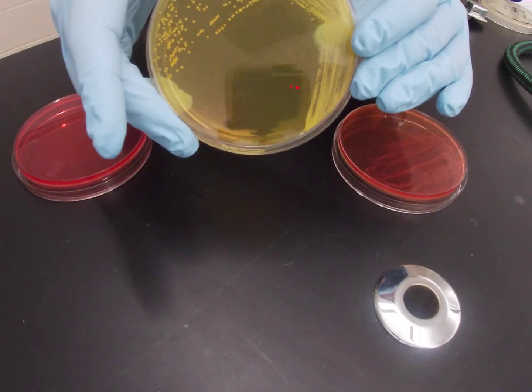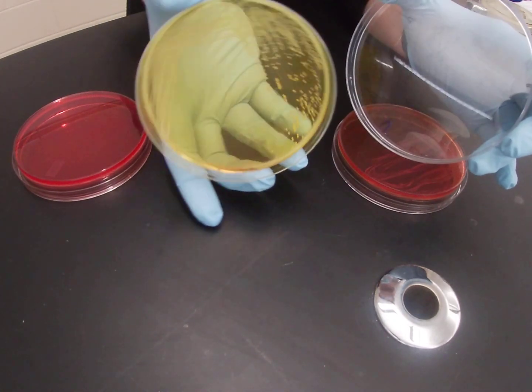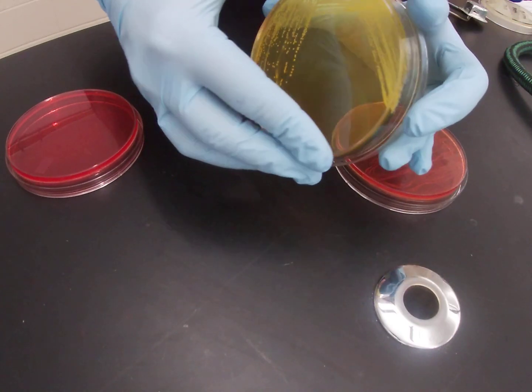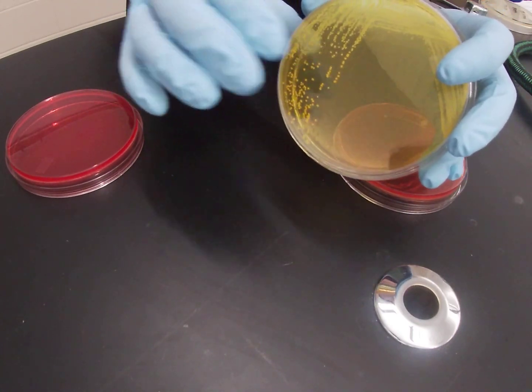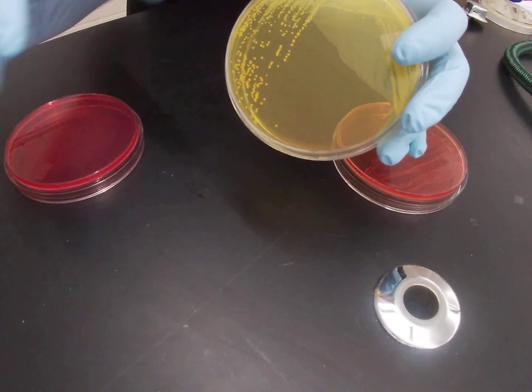Here you can see Staph aureus growing on a mannitol salt plate, and you can see that the plate is now very, very bright yellow, which is indicative of mannitol fermentation. So when organisms can ferment mannitol, they change the plate from this red to this really bright yellow color.